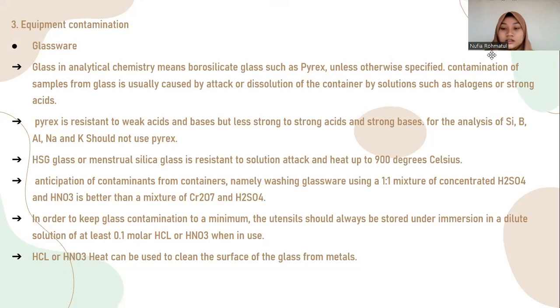mixture of concentrated H2SO4 and HNO3, which is better than a mixture of K2Cr2O7 and H2SO4.